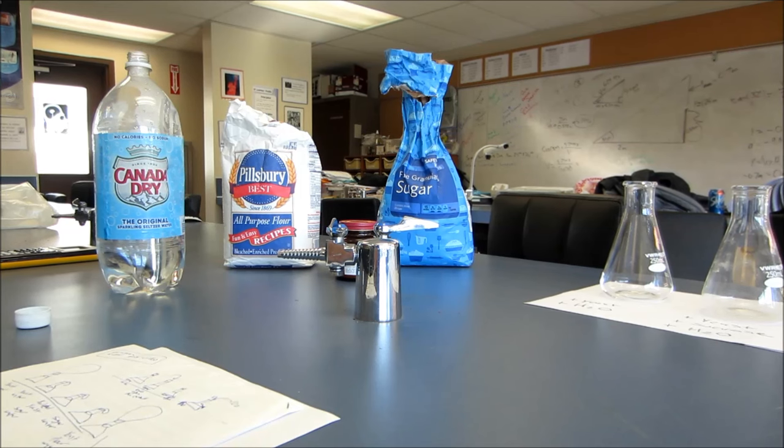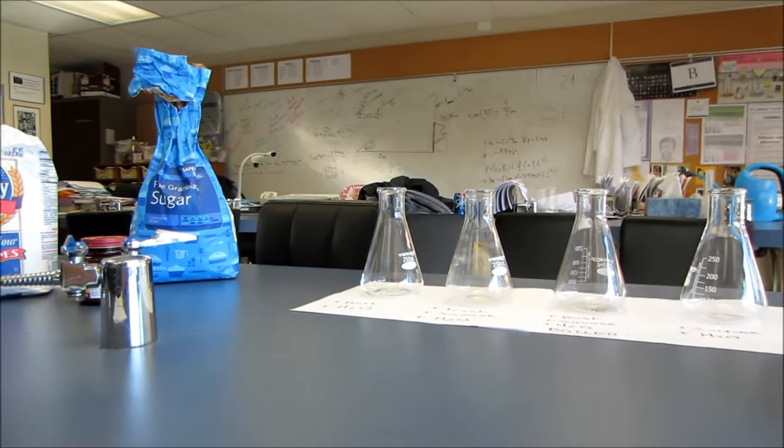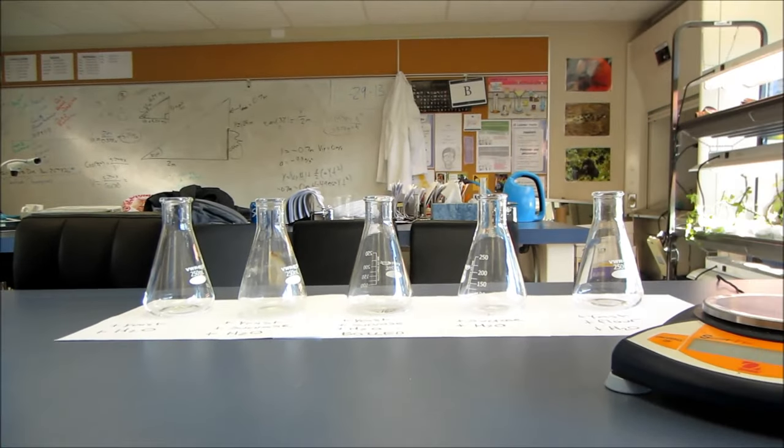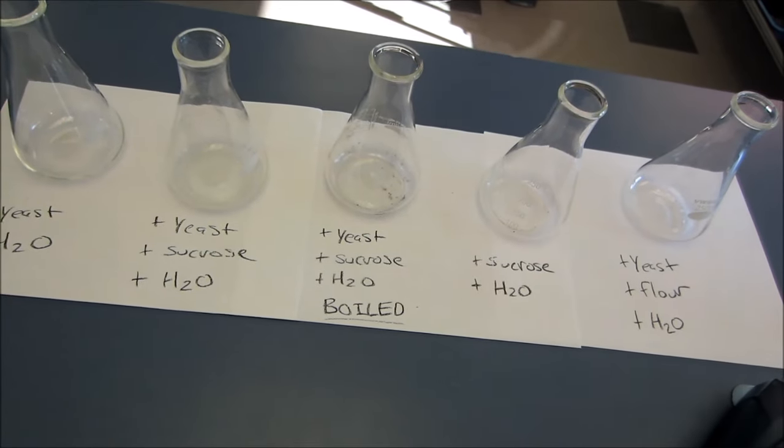That's why I creatively call it the yeast fermentation lab. It's a very simple lab. All we need is some water, some food for the yeast. I've got flour and sugar and some yeast which you can buy in the grocery store. I have several different flasks, five different flasks and I'm going to create different conditions for the yeast to grow in.